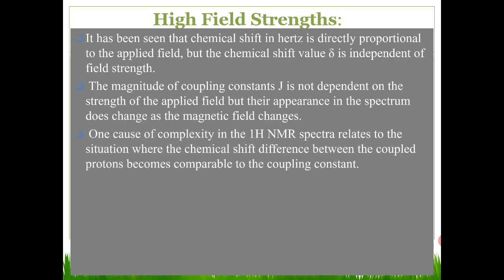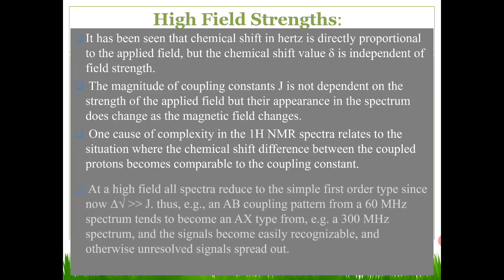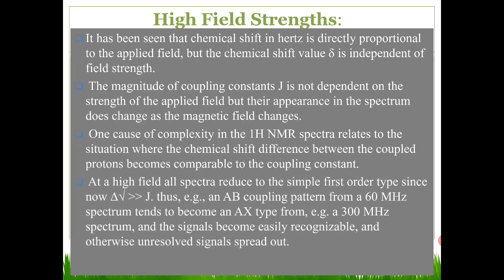One cause of complexity in proton NMR spectra relates to the situation where the chemical shift difference between the coupled protons becomes comparable to the coupling constant. At high field, the spectra reduce to the simple first order type, since the chemical shift difference is far greater than the coupling constant.